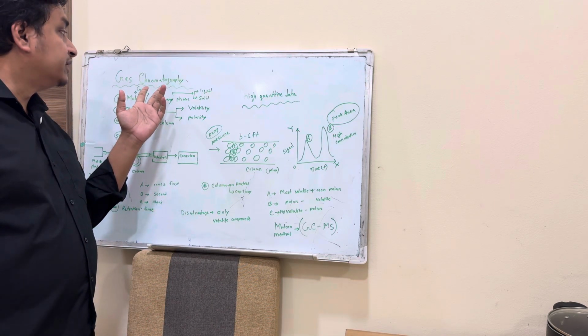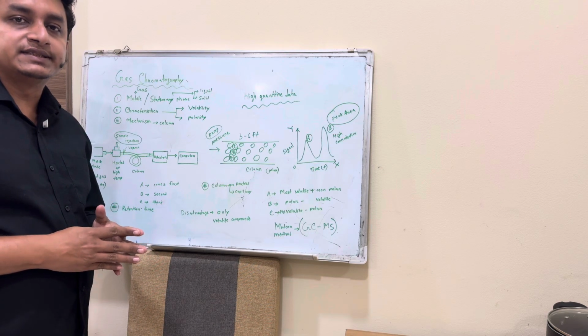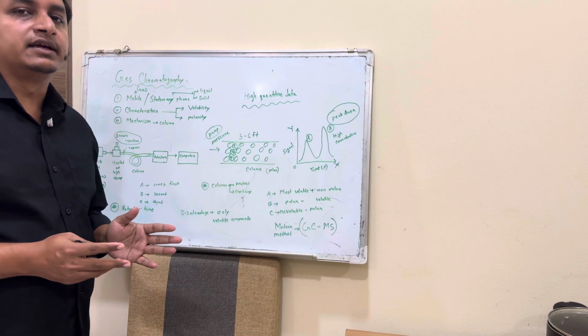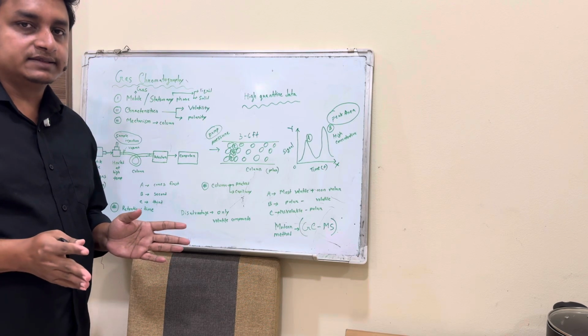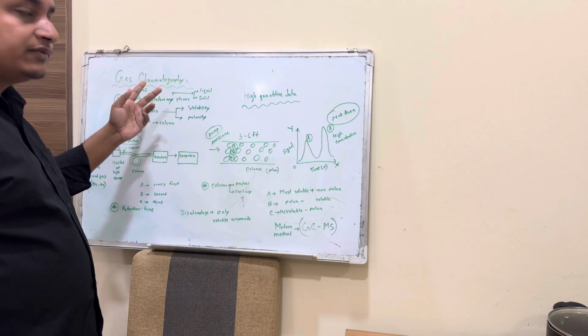This is chromatography. Chromatography is a separation process. It can be of different types, like gas chromatography, high performance liquid chromatography, etc. In this video, I'll discuss gas chromatography.